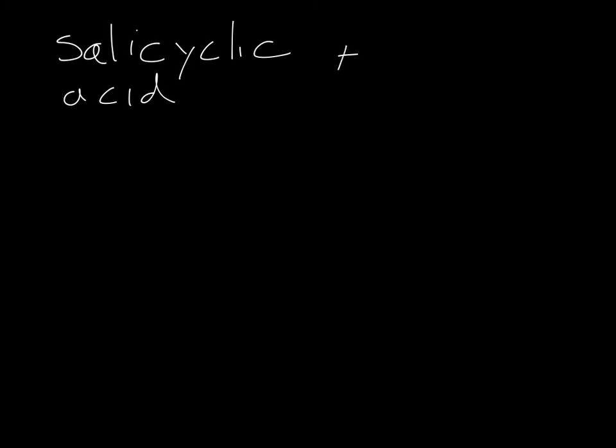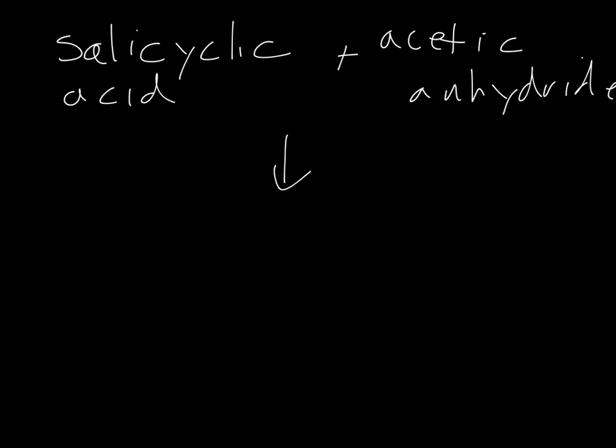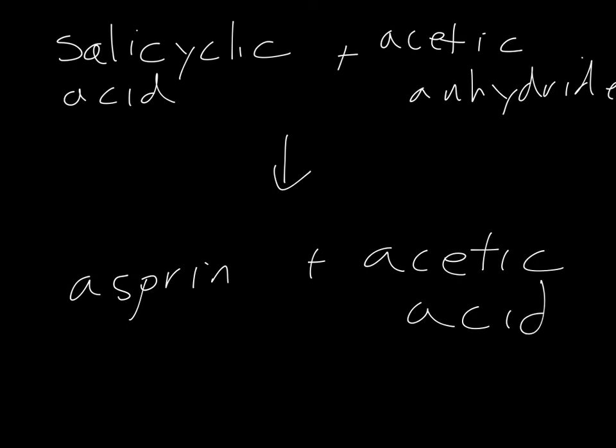Let's take a look at the reaction that we'll be conducting. In this lab, we'll be reacting salicylic acid with acetic anhydride to yield aspirin plus acetic acid.